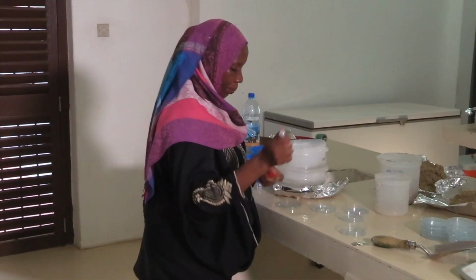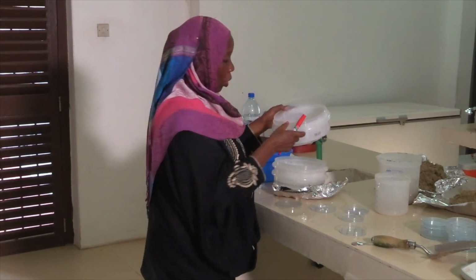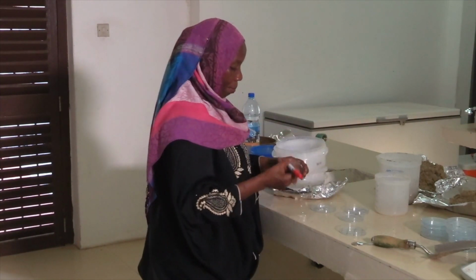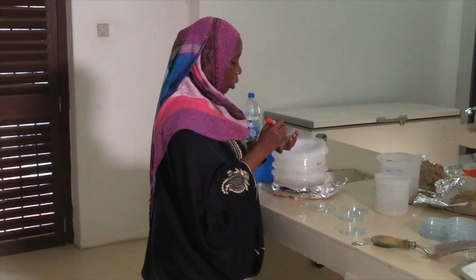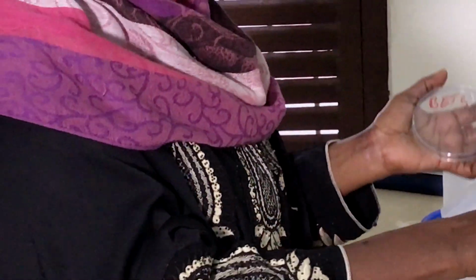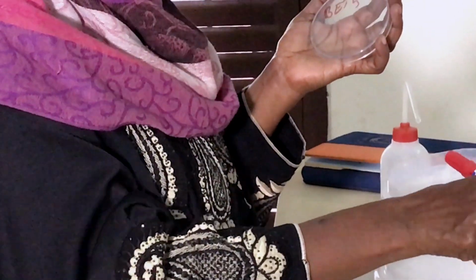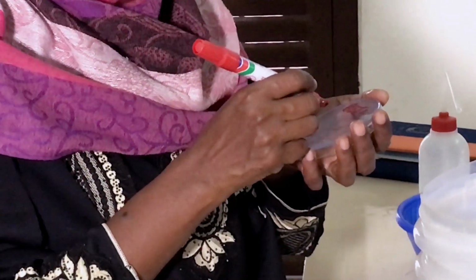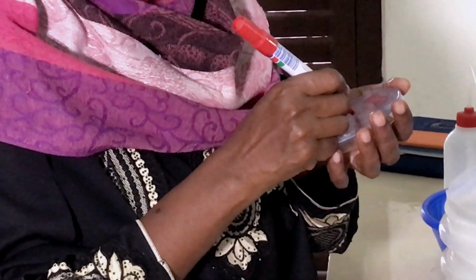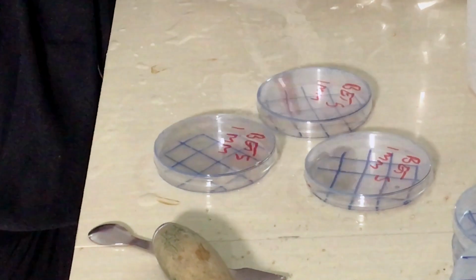For example, the petri dish for 1 millimeter should be numbered, as we remember, Petri number 5, and the ratio is 1 millimeter. I think 3 of them is enough.